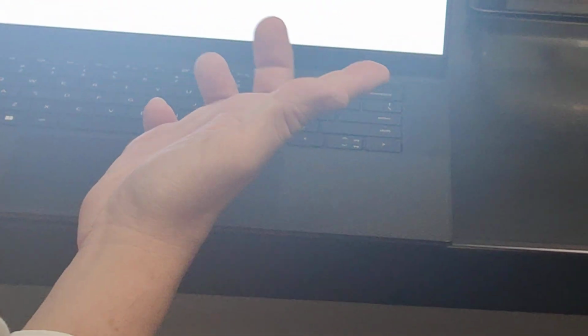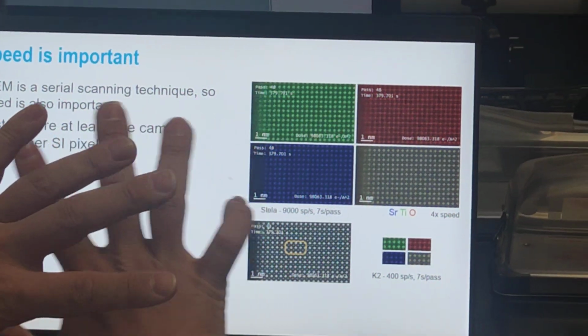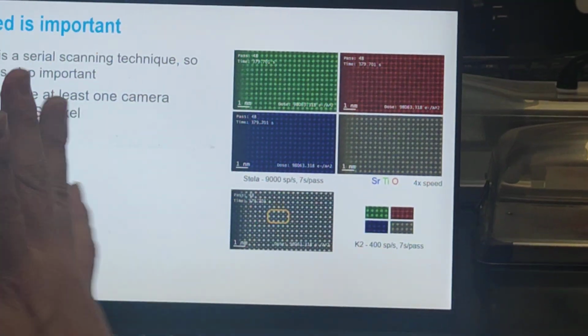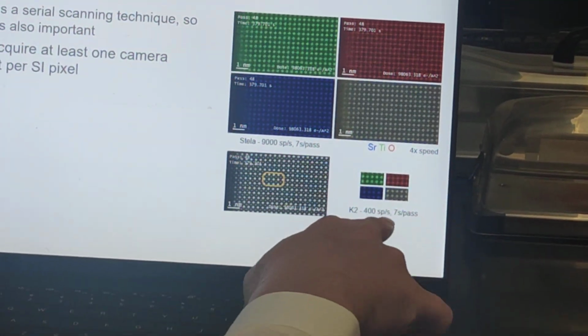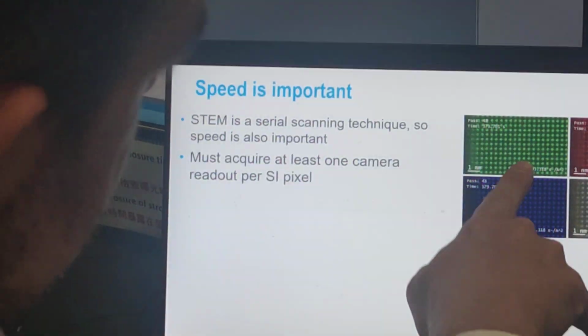not very many passes, and then you get like these nice rigid frames because each one of those you get a kind of a shift frame to frame, but you don't get distortion within the frames because you're scanning fast enough. Yes. And then this is just comparing 400 FPS versus 9000.